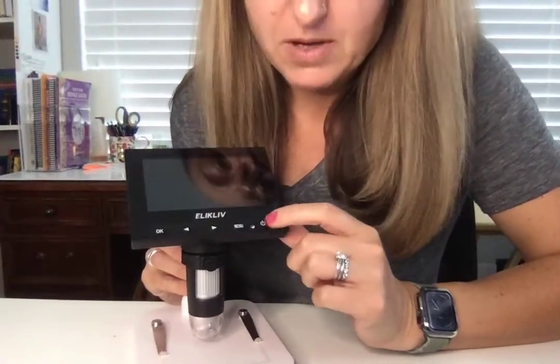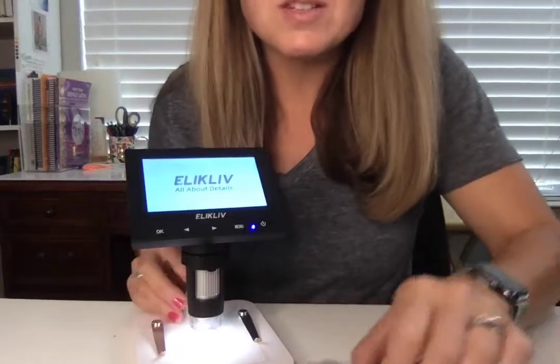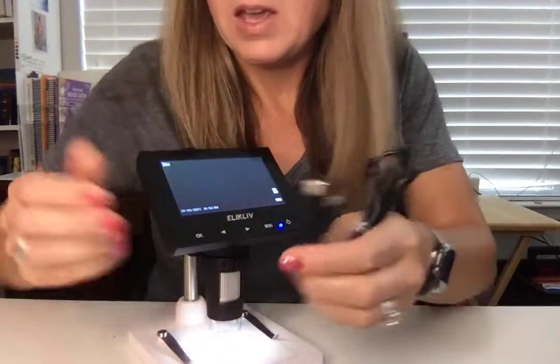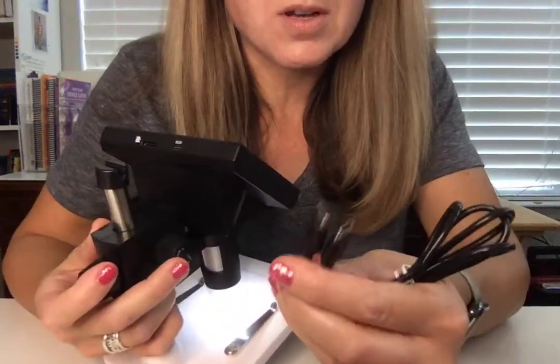There's a power button right here. We're going to power it on — and by the way, this is rechargeable. It comes with a charging cable and you just plug it in back here and then plug it into an outlet.